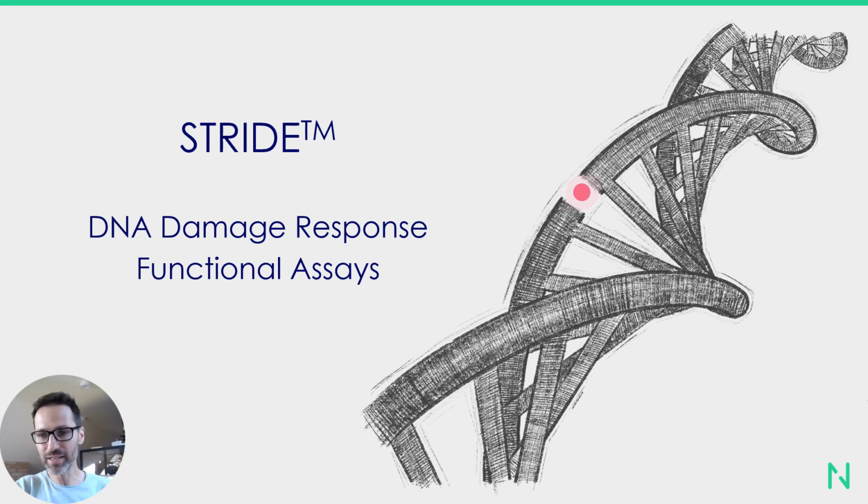This is a group of assays that allow to visualize and then quantify DNA breaks associated with certain DNA repair proteins, and by that to understand better the biology of DNA repair or the mechanisms of action of DNA interfering compounds.